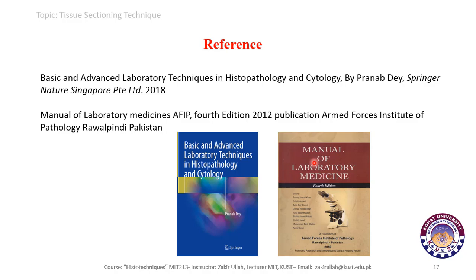So that was all about the tissue sectioning technique, how a tissue is sectioned with the help of the microtome, then how the ribbon is prepared, and if there is any difficulty in the ribbon preparation, some tips which will help in the ribbon preparation and in maintaining wrinkle free tissue sections for picking up on the slides.